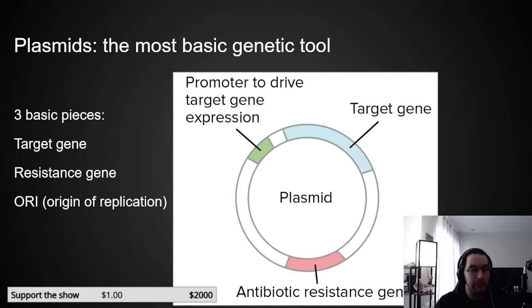So they're able to survive. Then you can grow them on media that is devoid of that chemical, so the yeast can't get that chemical from the media. Without it, they'll just die. But only the ones that have taken in the new DNA are able to produce it and therefore survive.